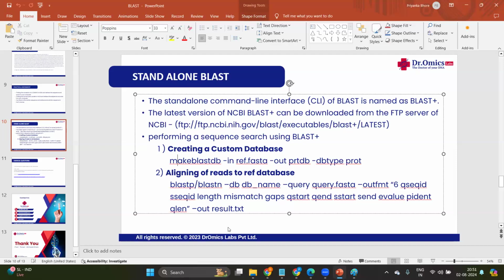Yes, sir. Have you performed the installation? Is it done? Okay, fine.